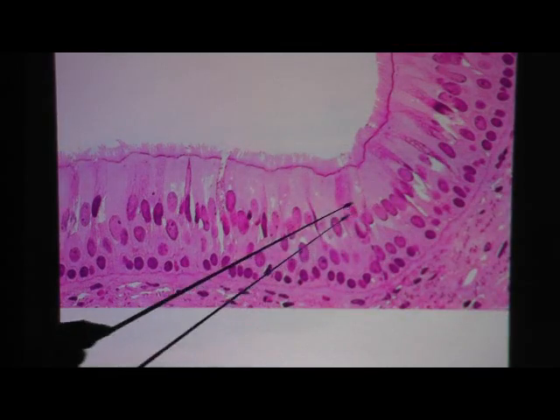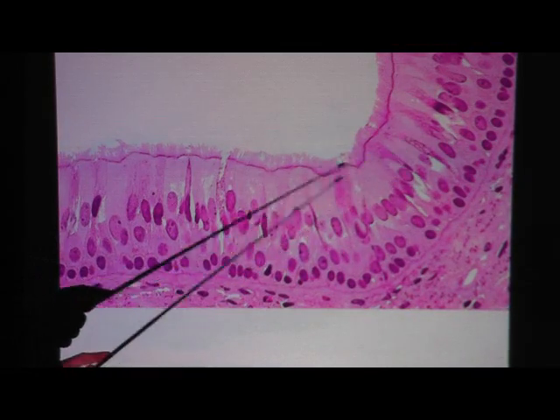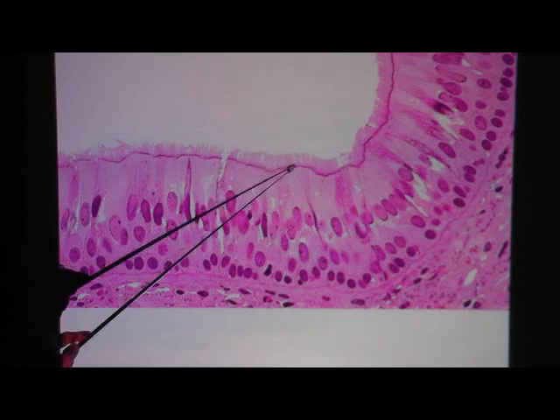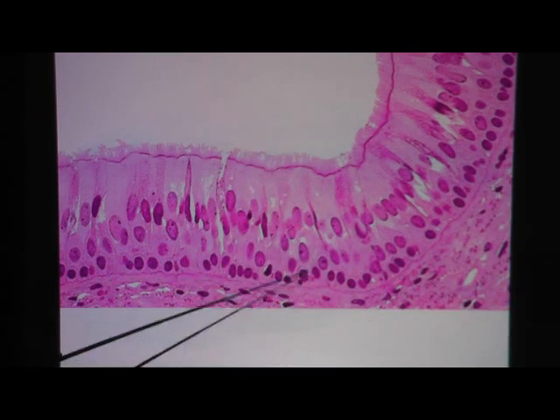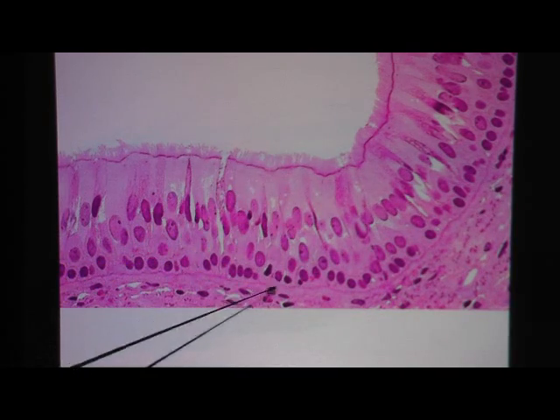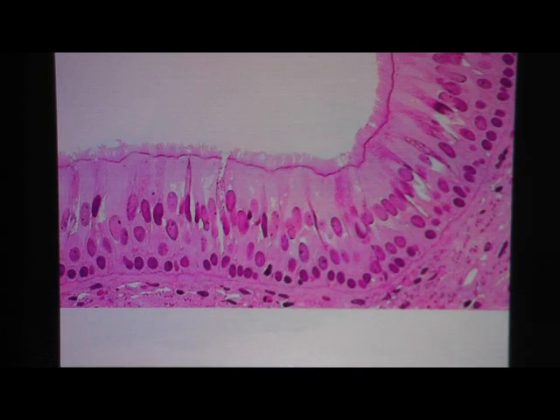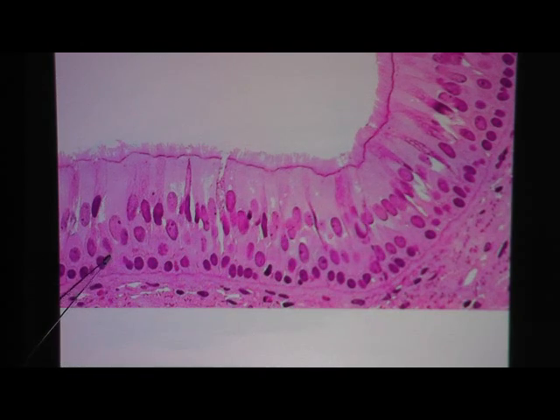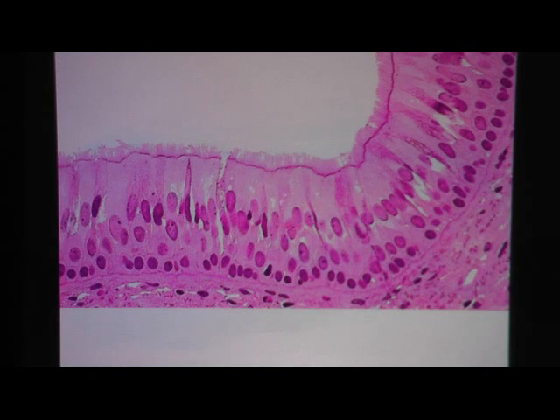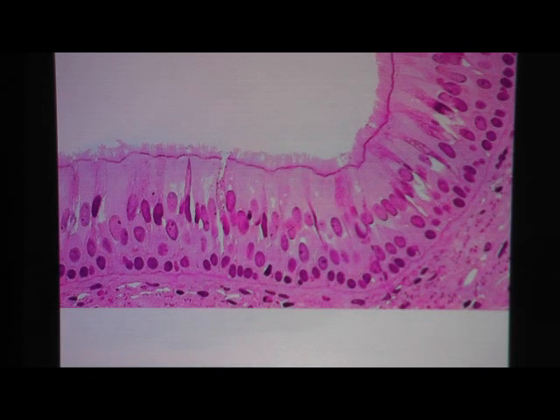At high magnification you can see clearly the cilia. See how tall and skinny these cells are — that's columnar. It gives the impression of many layers of nuclei, but it's only one layer thick, so: pseudo-stratified, ciliated, pseudo-stratified columnar epithelium.